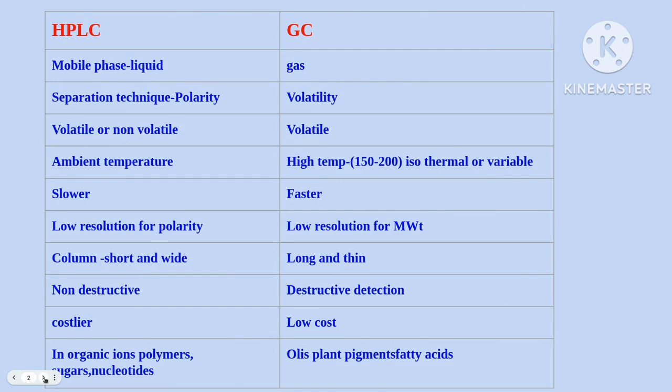In HPLC, the sample is mixed with a liquid and is passed through a column filled with a solid stationary phase or solid sheet of the stationary phase. This method identifies the substances by measuring how long it takes for the sample to move through the stationary phase. A detector is used at the end to identify the unique components and indicates each substance's retention time and concentration on a chromatograph.